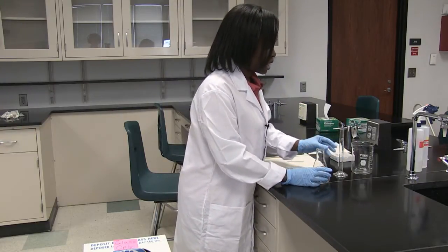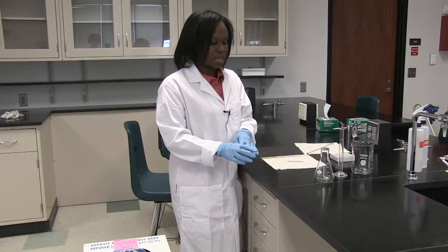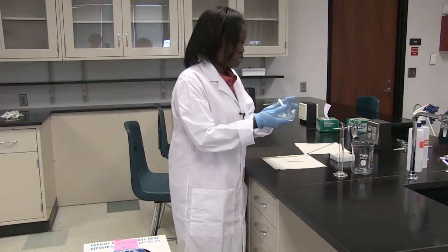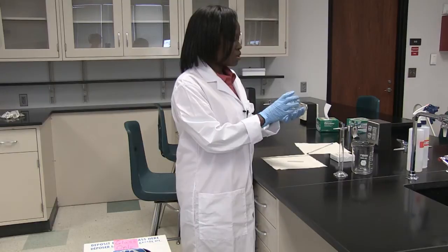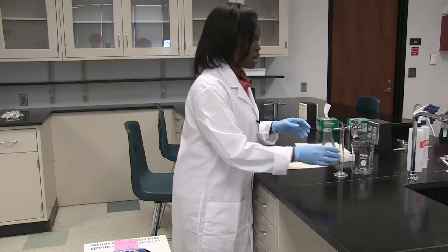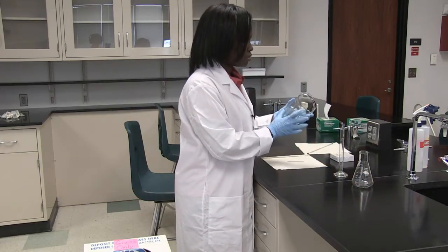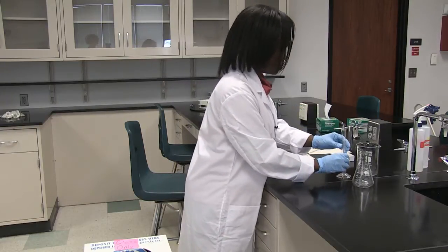It's very important to handle these with care because if they fall to the ground they could shatter, they could break, and then they could cause you to get cut. So before you use your glassware, make sure you examine it for any cracks or any stars that would indicate that it could break while you're using it. Make sure you examine all these — if you notice they are free from cracks, they are okay to be used.